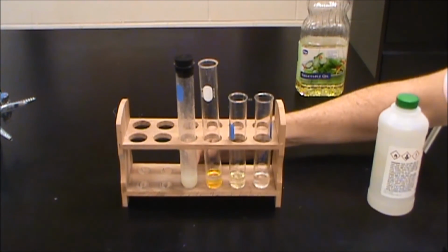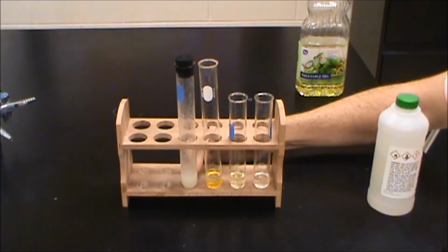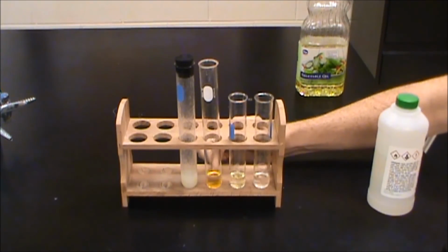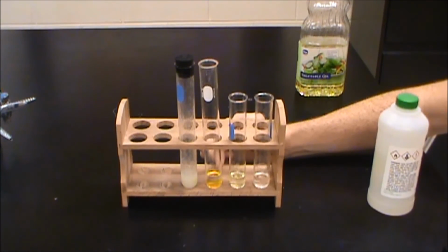And what's happened there is that this has reacted with the bromine because of the presence of double or triple bonds. This one is only single bonds, and so we do not see any reaction with the bromine. In order to get these to react, we would need to use ultraviolet light or something along those lines to get that to work.